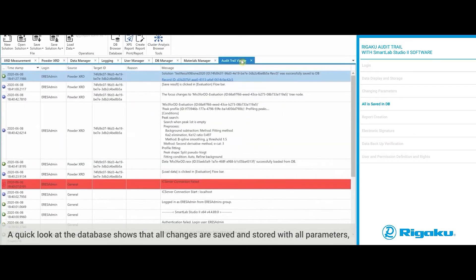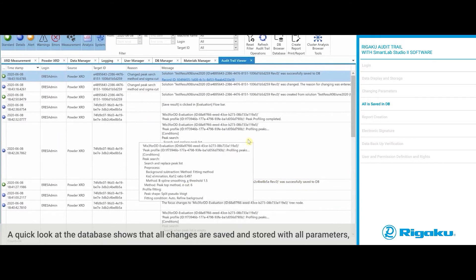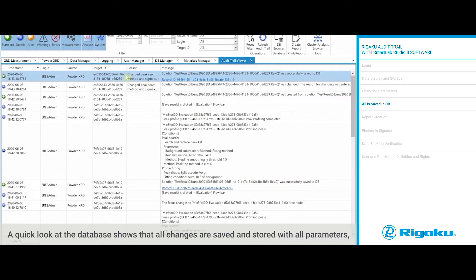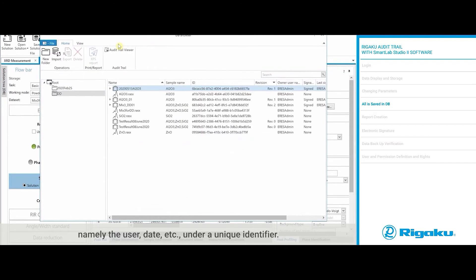A quick look at the database shows that all changes are saved and stored with all the parameters, namely the user, the date, etc., under a unique identifier.